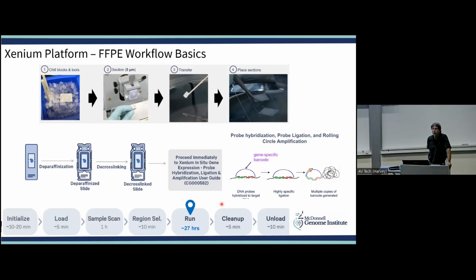With that space, it is certainly possible to put multiple sections. As you saw, this is 12 millimeters by 24 millimeters. You can put multiple sections in that space, but be very careful not to have those things overlapping or anything like that, because again, that can create problems.